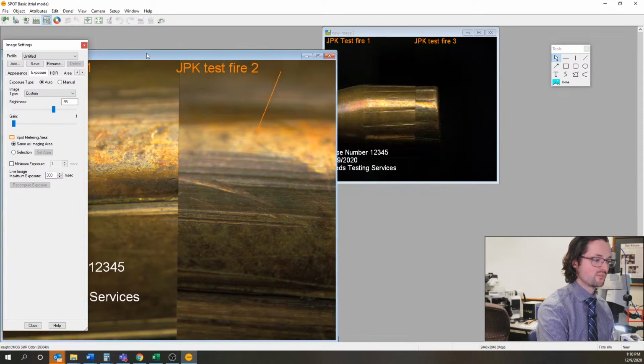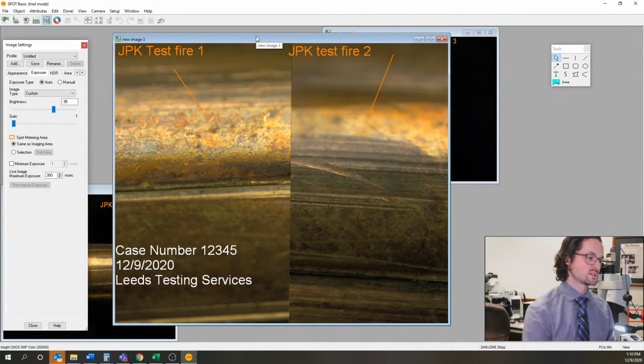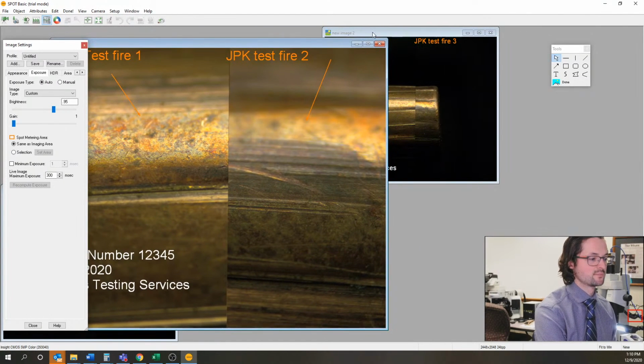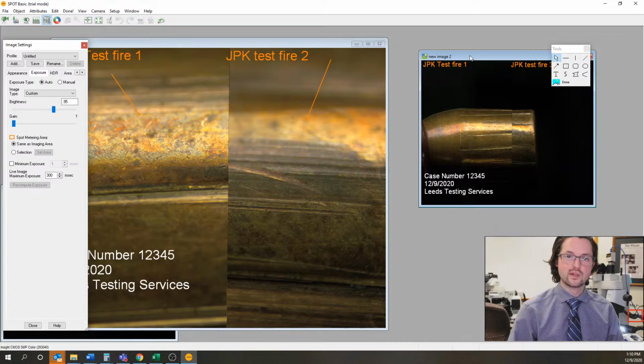This can be really helpful as a way to very quickly do annotations. And what I suggest people do is, if you want to do this method, you can just make a picture that you use as your template and just save it to your desktop. And when you start your day, you can just load that template picture and use that as the basis of all your annotations.